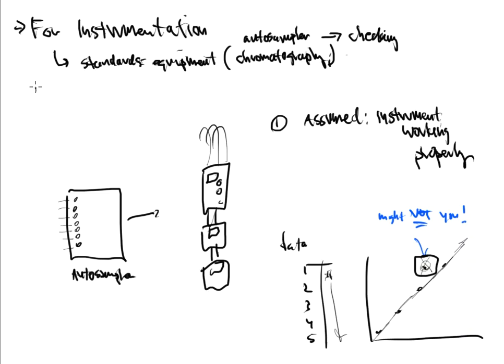Each auto sampler has a needle, just like an actual needle that you might have used up to this point to make samples or to inject things with. But that auto sampler has a needle, and this needle can get clogged. This needle can get air bubbles on the inside. The needle can actually malfunction. It might not suck up anything at all. The needle can actually suck up too much at any point in time.